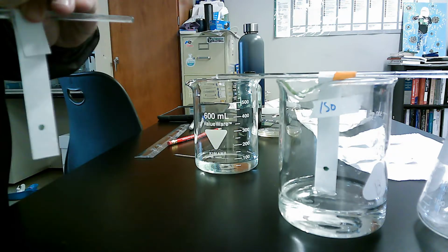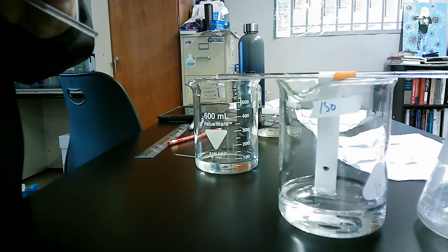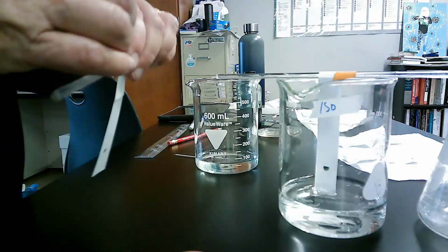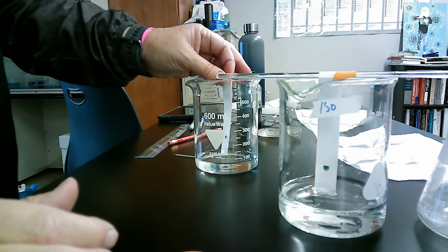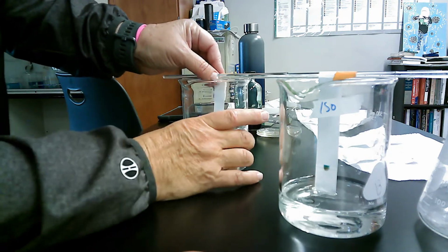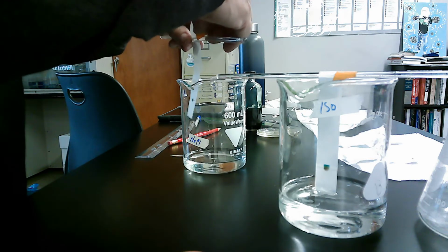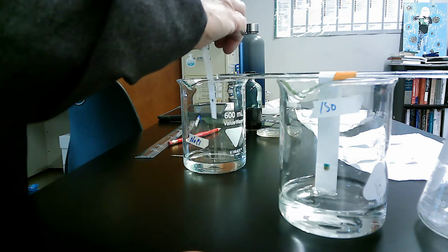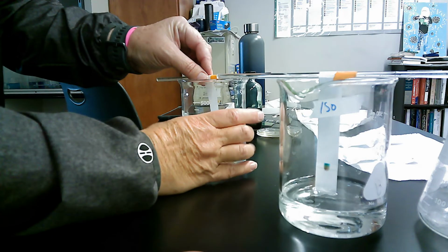So I'm going to put a little piece of tape to hold this one. Again, several people had to redo this part because they put it in and then it would get wet. So I can see where this is not quite there. So I'm going to go a little bit farther down. And now it is touching.